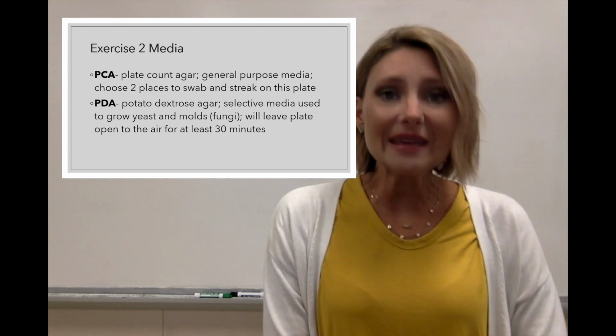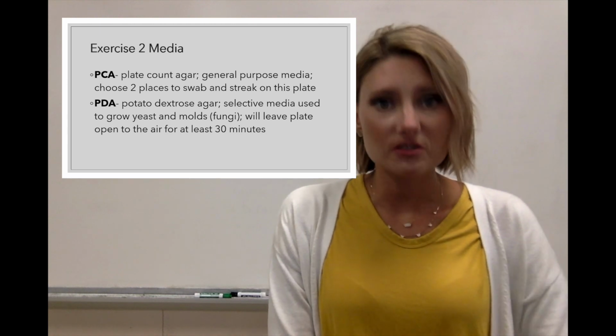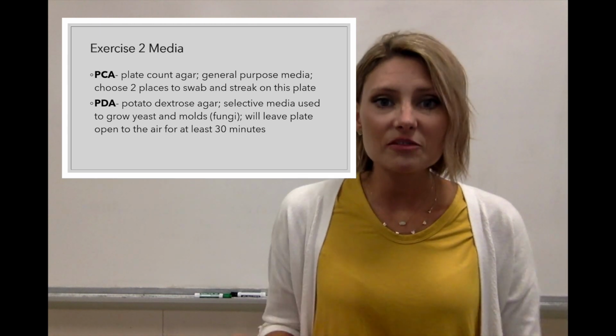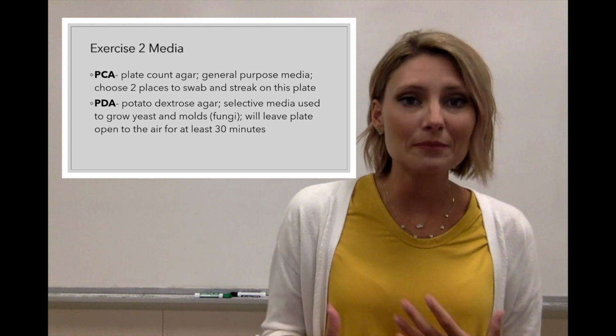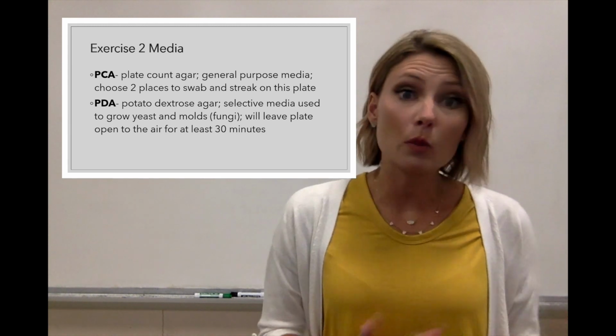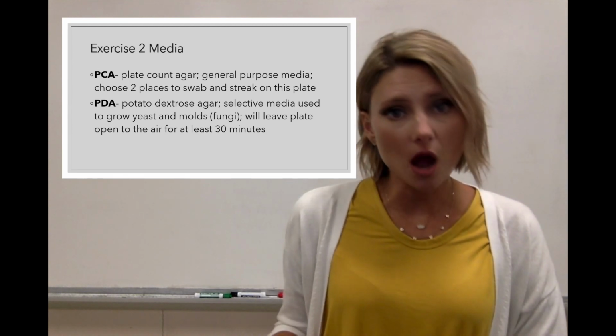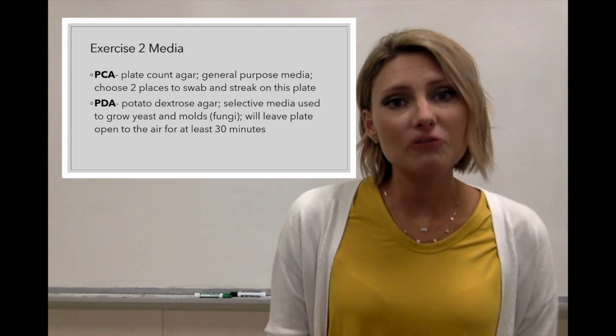Now, the PDA plate, that is the more selective media, and when we say selective media, usually it has something in the media that's going to inhibit the growth of things that we don't want. So PDA stands for potato dextrose agar, and this is selecting for fungus.